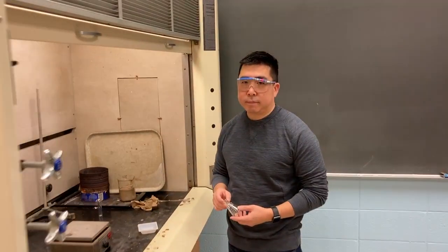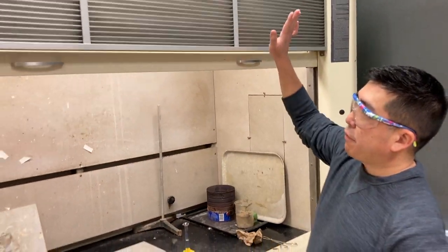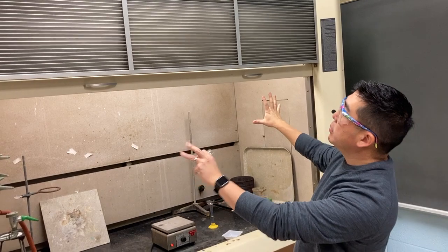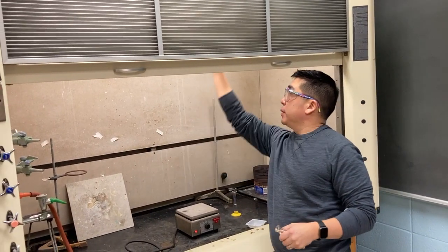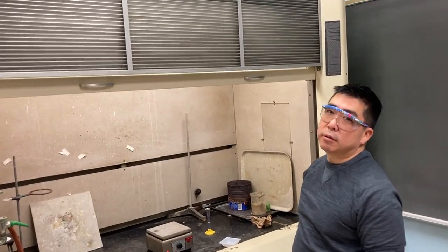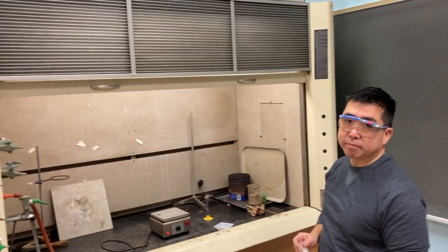Okay, looks like we moved locations here. What's this thing called? This is the fume hood, right? This is so that anytime there's a reaction that produces a lot of fumes, it gets sucked up into the vents and it shoots out to the top of the roof. We actually saw this earlier in the year when we did the alkali metal demonstration.